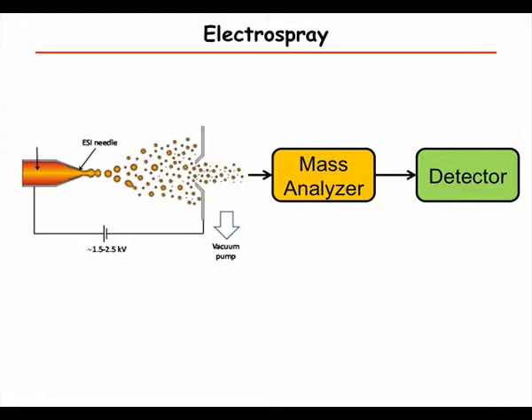It's more a nuisance, because you have to clean the instrument when these surfaces get covered with too much, and then it doesn't work as well. So you have to take it apart and clean it regularly. But still, the biggest problem is probably the sample preparation, where you have even more losses. But it's definitely something that they're trying to optimize.